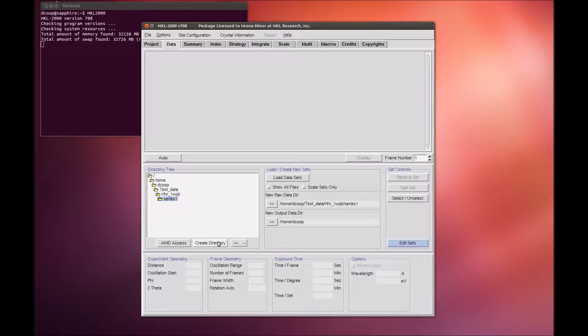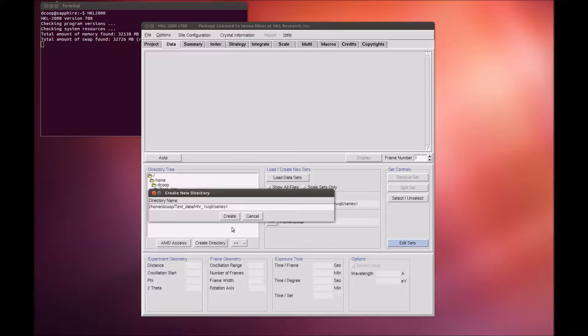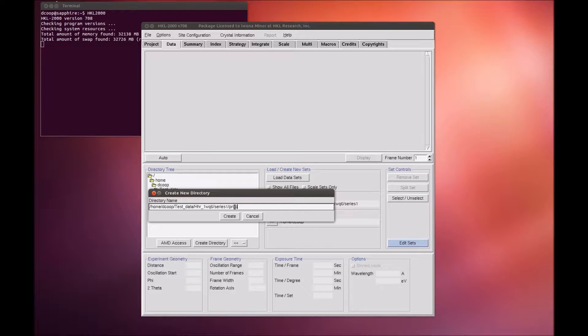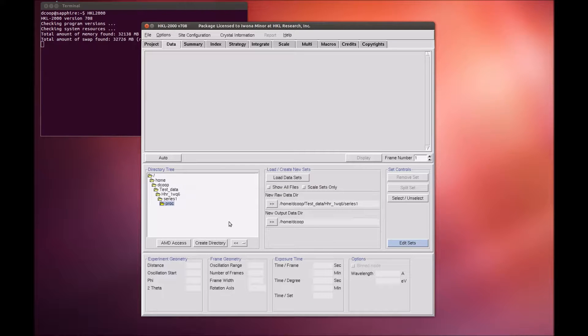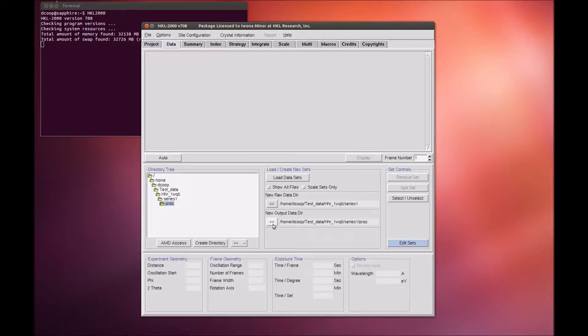It is a good idea to create a new directory for the program output to keep the original images separate from the files that result from processing the images. After creating a directory, select it and click on the double arrow button in the New Output Data Directory field.